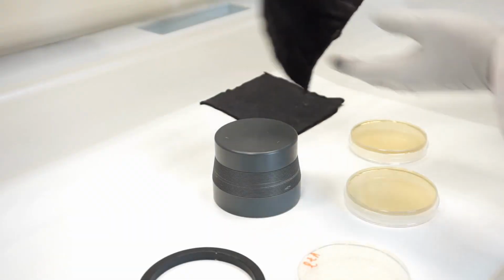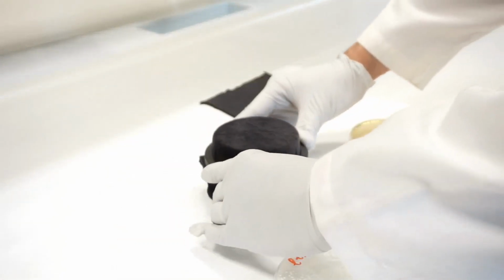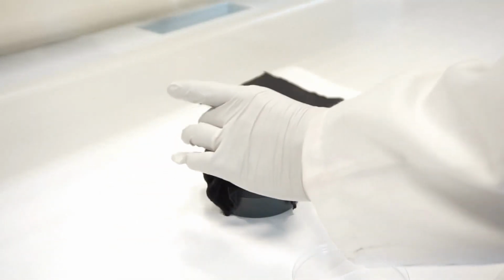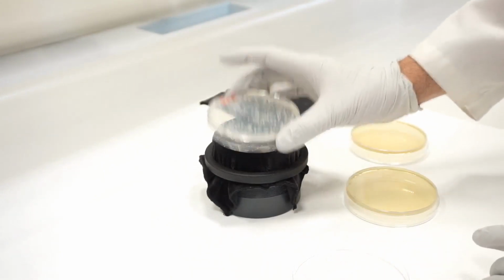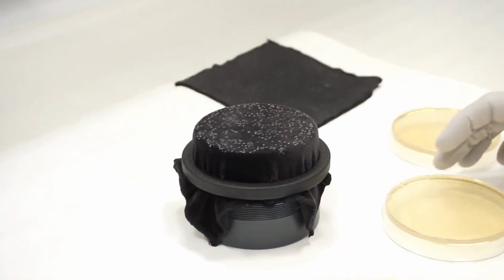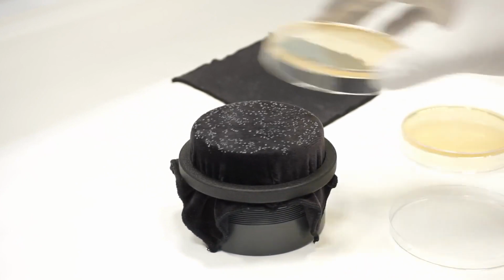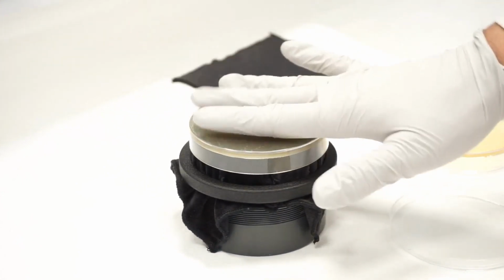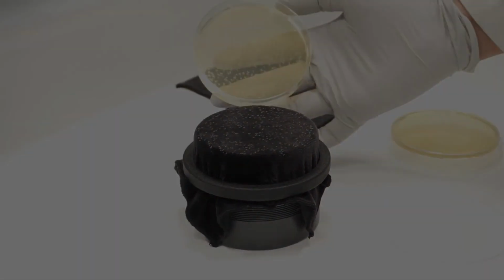Once transformants appear on 5FOA plates, usually after 3 days of incubation at 30 degrees, replica plate them onto non-selective YPDA plates and also on YPDA plates containing G418, marking each plate to facilitate their subsequent comparison. Incubate the plates overnight at 30 degrees.